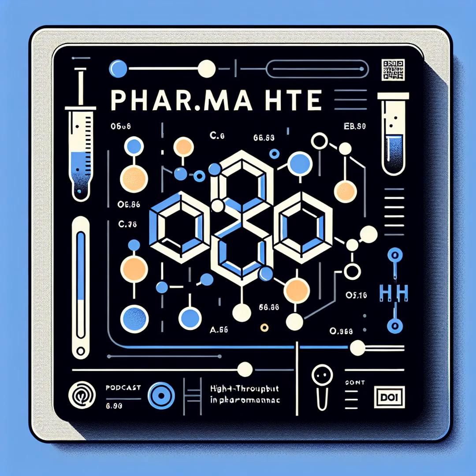So, what exactly is high-throughput experimentation and why is it so important? Well, it's all about speed and efficiency in drug discovery and development. It's about radically accelerating the process of finding the best chemical reactions and refining them to create reliable manufacturing routes for new drugs. This leads to getting life-saving medicines to patients much faster than with traditional methods.